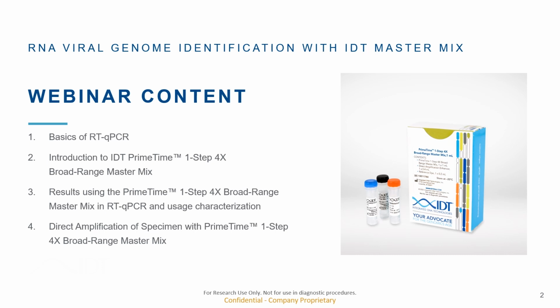I'll describe the development process and discuss characteristics and general usage information. And finally, I'll show data using multiplexed primers and probes specific for influenza A, influenza B, SARS-CoV-2, and RNase-P for direct amplification of viral RNA in human specimens.